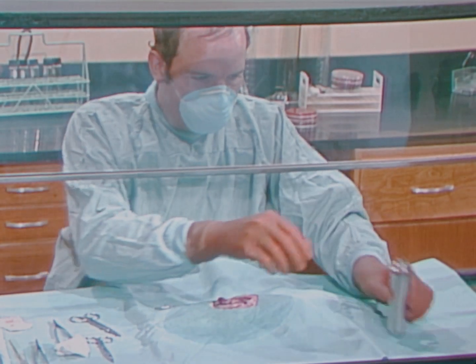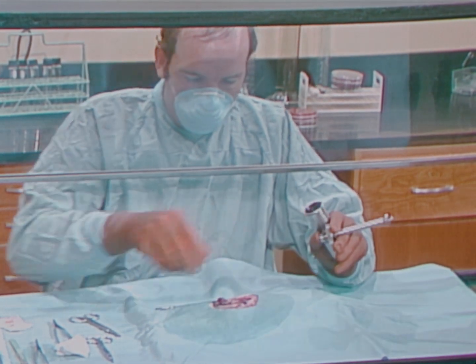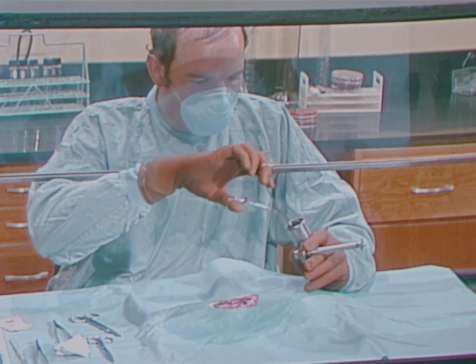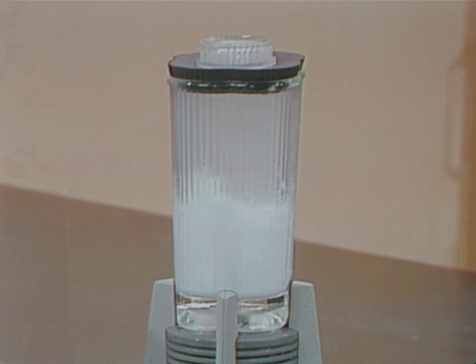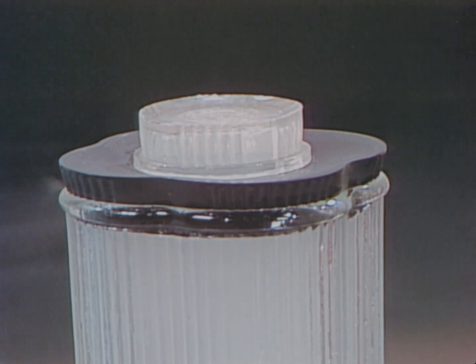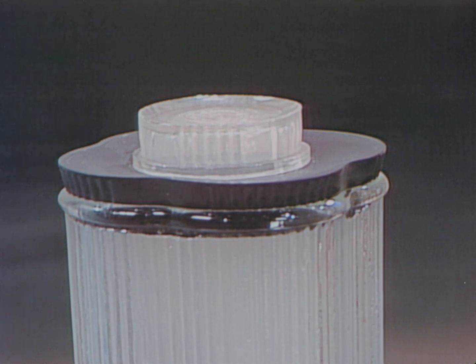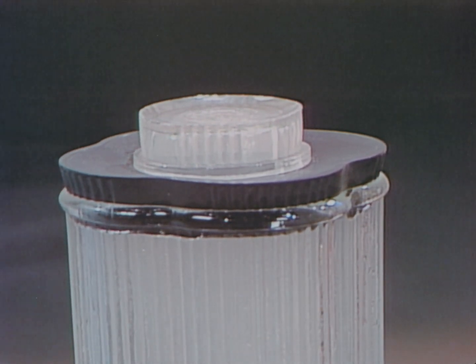Animal organs must often be homogenized. The risk during homogenization may be minimized by proper use of the high-speed blender. A household blender should not be used to homogenize tissue. The loose cover will release many droplet nuclei aerosols into the air. This is an unnecessary danger because aerosol-free blenders are available.